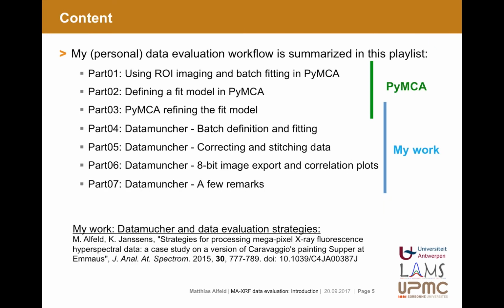So, the content of this playlist is my personal data evaluation workflow for the investigation of historical paintings. There are 7 parts, and the first 3 parts deal with PyMCA. Parts 3 to 7 are based on my own work, which I published in this article down here in the Journal of Analytical Atomic Spectrometry.